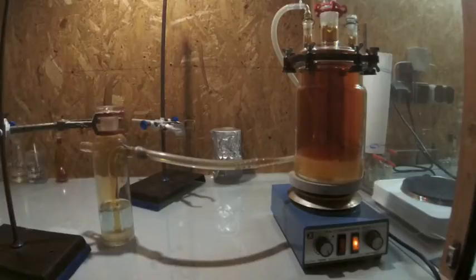When all the gases were gone, I proceeded as usual. I gave the mixture around an hour to fully react and stirred it vigorously. In the security wash bottle some of the nitrogen oxides had condensed, and I recovered them and stored them safely in a glass ampoule. Then I had to reduce the volume of the reaction mixture.